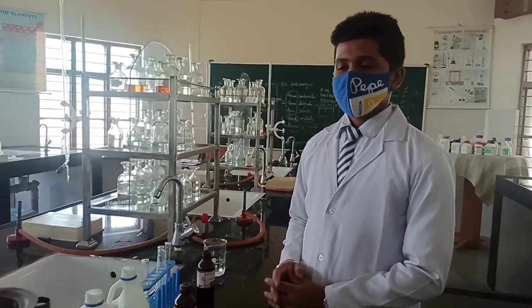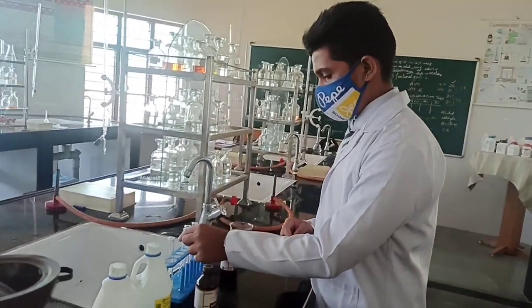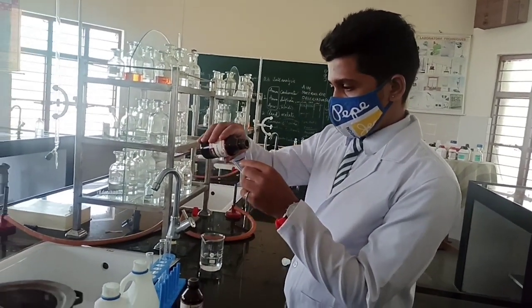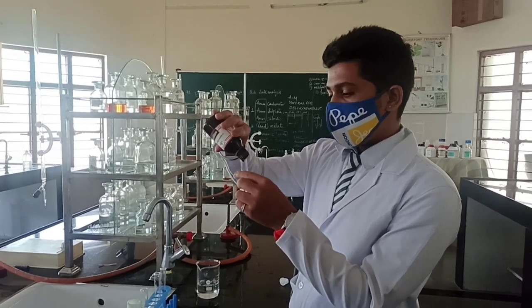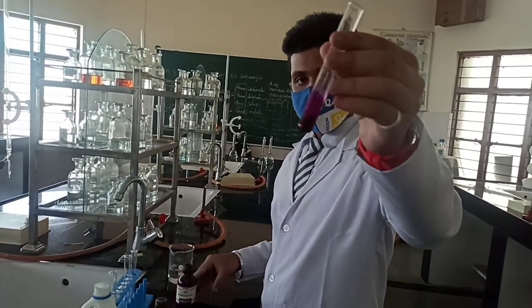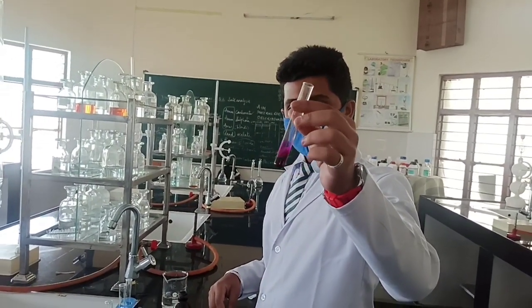Jayaditya has already kept three test tubes with the sample. Very firstly we will perform the Schiff's test. Take one of the test tubes — the sample is already kept and now he is going to add Schiff's reagent. The expected color is pinkish magenta. The solution changes from colorless to pinkish magenta.